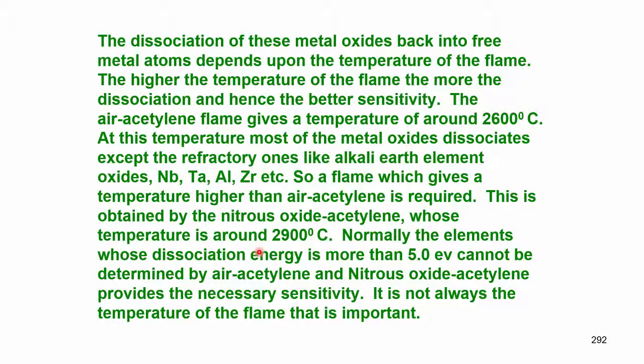Okay. So, the dissociation of the metal oxides back into free metal atoms depends on the temperature of the flame. If the flame temperature is high, there is more dissociation, more number of free atoms. The higher the temperature, more is the dissociation and better sensitivity. And whenever we talk of atomic absorption, what we talk about is the sensitivity, especially interference means we are talking about the sensitivity. That means absorbance should be as high as possible for a given sample.